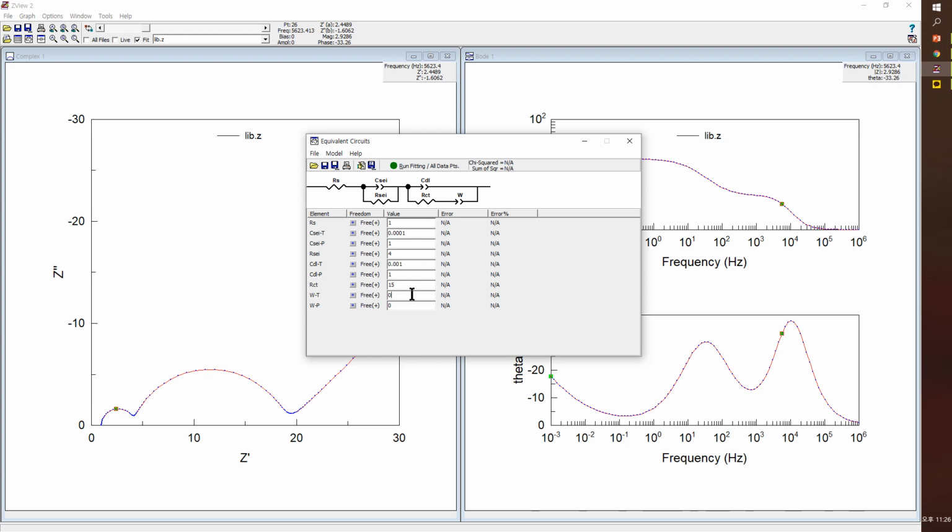And how about Warburg impedance? Also, you have learned about how to guess the value of T of the Warburg impedance. Anyway, the exponent of the Warburg is assumed to be 0.5, sometimes 0.49 or 0.51, but in this case I have assumed that our Warburg is ideal behavior. And the T is some parameter value about the Warburg.